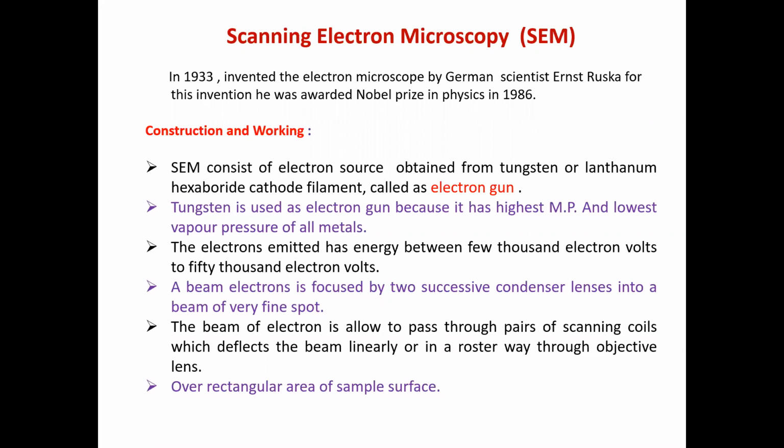The electrons emitted have energy between a few thousand electron volts and 50,000 electron volts.